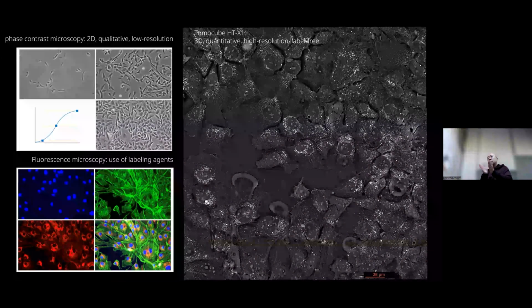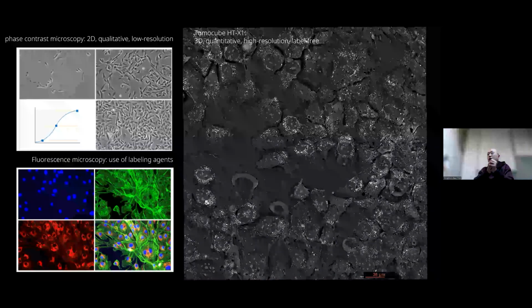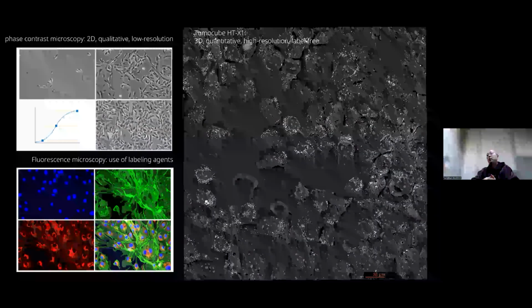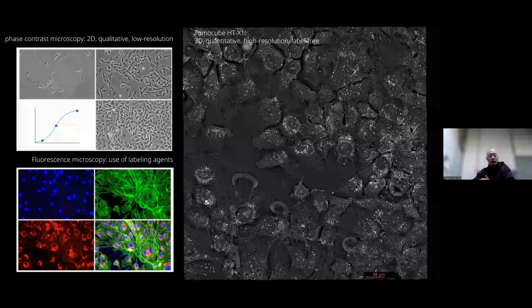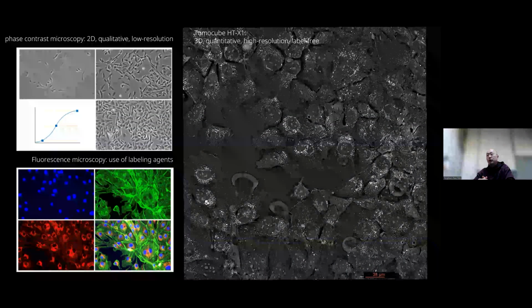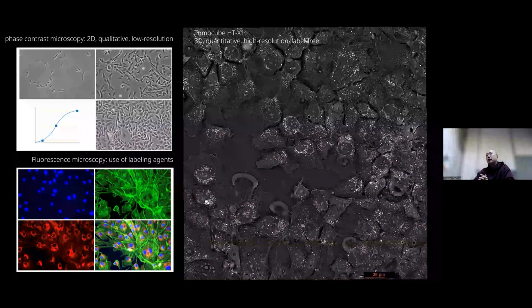So we are doing two approaches simultaneously. Advanced users can readily use our data set for their analysis, and we are also providing internally developed software so that scientists who are not familiar with this kind of advanced imaging system can still use the advanced cell analysis features.